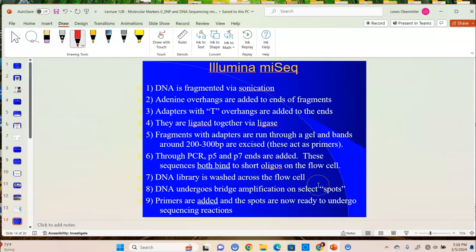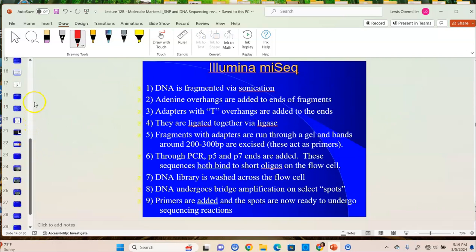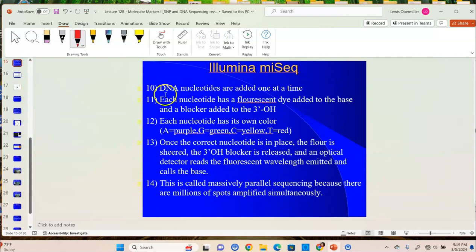In this flow cell, a DNA library is washed across. The library would be all of the sequences that were created from sonicating your DNA if you sent this off to them. It does something called bridge amplification, and I'll show you a video of that. And then we add primers to those reactions, and in the end, it's going to look at those and tell you what the sequences are on each of the targets, right? So we add the nucleotides one at a time. They're fluorescently labeled, right? It also has a blocker on the 3' end. So until they cut the blocker off, no extra nucleotides can be added.